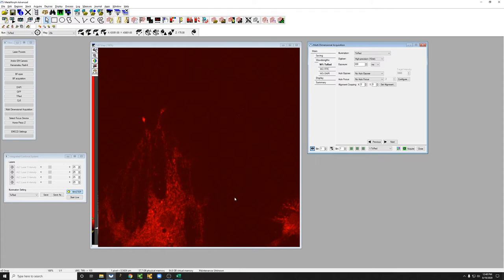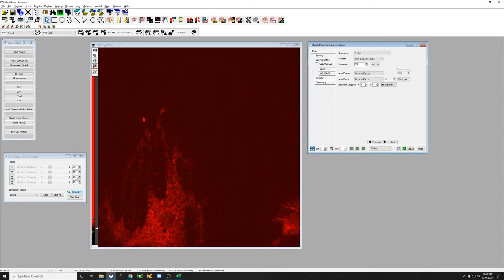what you need to check is that whatever laser power you're using is not going to photo damage them. They should be viable at the end of the experiment and it's not going to bleach the fluorophores you're using to track whatever biological parameter you're interested in. Figuring out what laser power is tolerable takes a bit of trial and error.